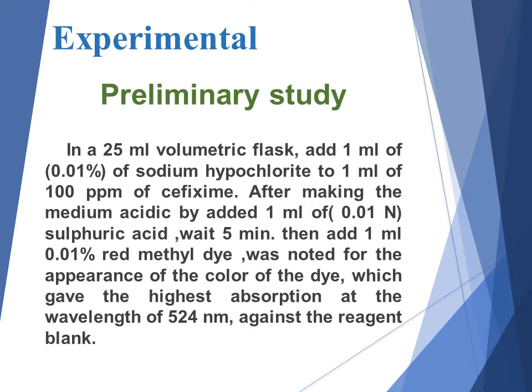After making the medium acidic by adding 1 ml of 0.01 normal sulfuric acid, wait 5 minutes, then add 1 ml of 0.01% methyl red dye. The appearance of the color of the dye was noted, which gave the highest absorption at the wavelength of 524 nanometer against the reagent blank.